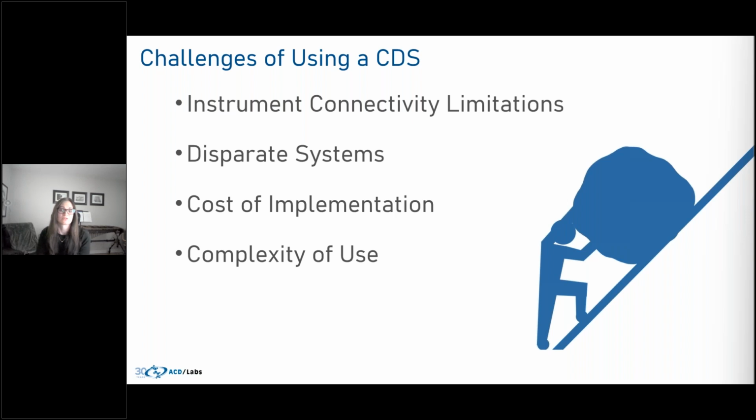The complexity of use. Some systems, as they're expert systems, can have quite steep learning curves, which would require extensive training. And then finally, limited contextual data. It might not be possible to provide the necessary context for comprehensive data analysis. For instance, your chemical structures will be stored in a different place.